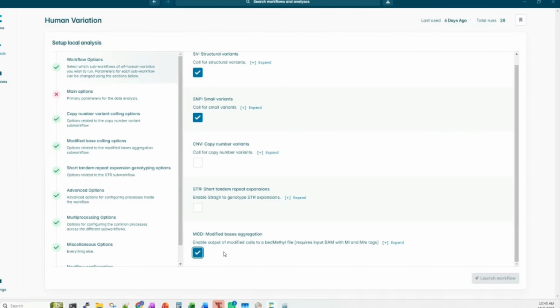By default, it can identify the methylated C, or 5-hmC, the hydroxymethylated C. In the human genome, we are less likely to have 6mA, the methylated adenine, but in some rare cases, EPI2ME has also detected it in the human genome. So it depends on the information that we obtain from the base calling. Here it is going to detect whatever is enabled over here.